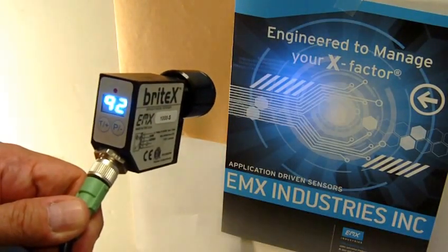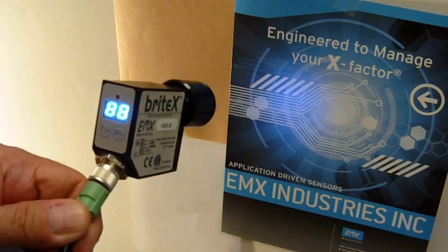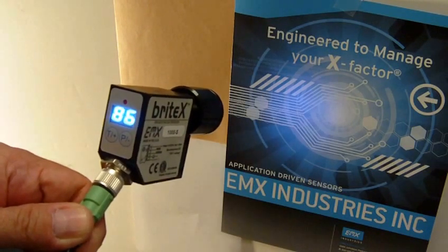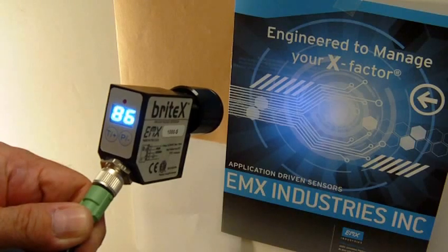This is a demonstration of the BrightX Model 1000S Sugar Color Sensor from EMX Industries. The BrightX 1000S is designed to measure raw or refined ICOMSA sugar color online at a lower cost than competing systems.